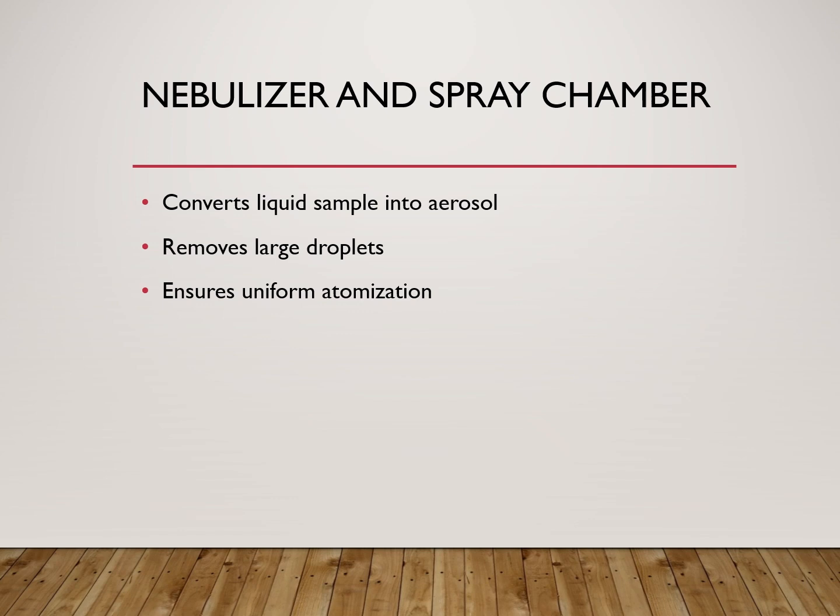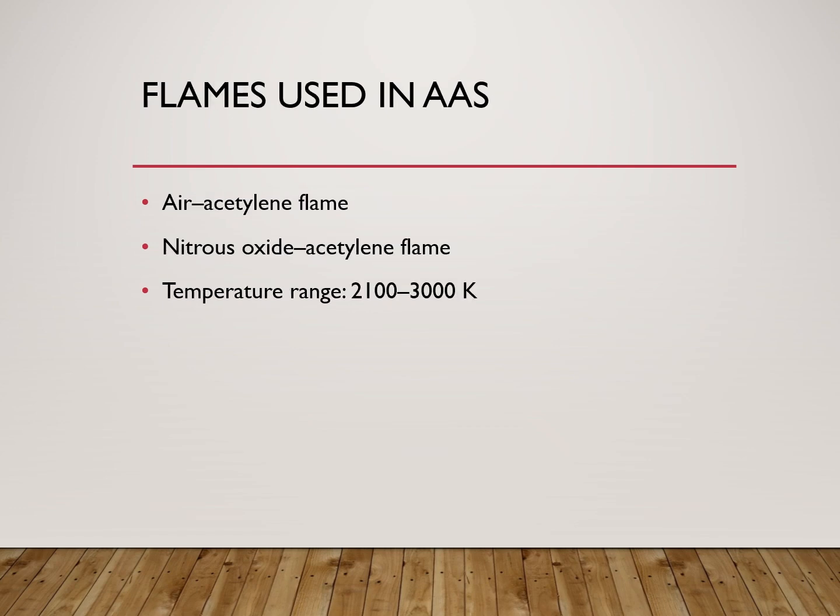The nebulizer converts the liquid sample into a fine aerosol, while the spray chamber removes large droplets. This ensures uniform atomization and stable flame conditions. Different flames are used in atomic absorption spectroscopy.